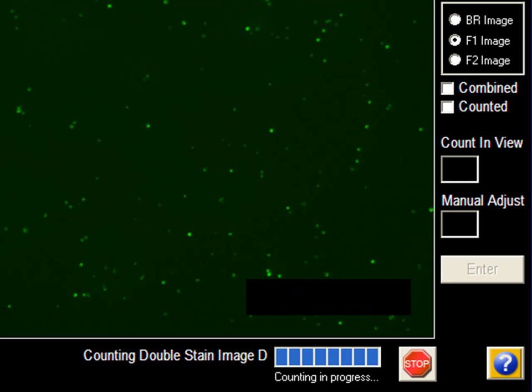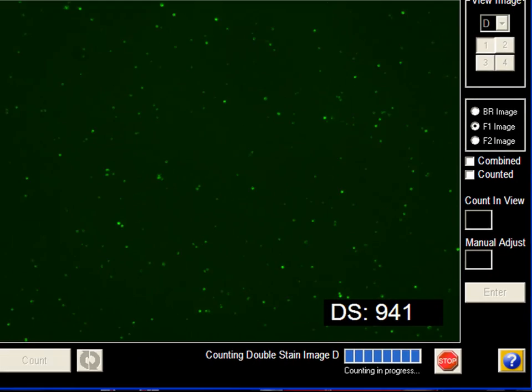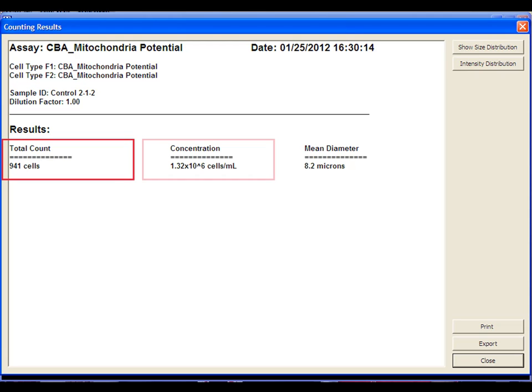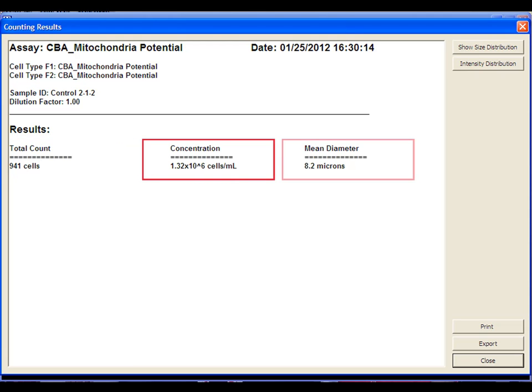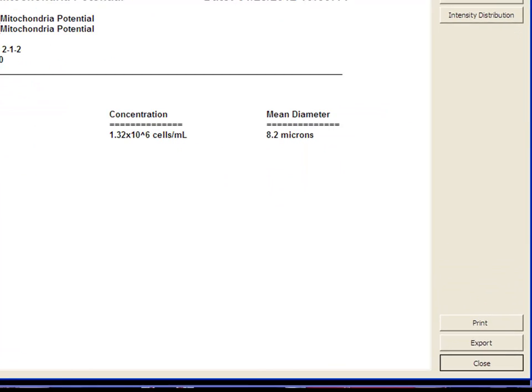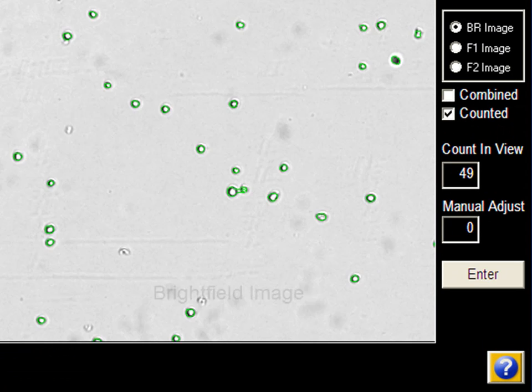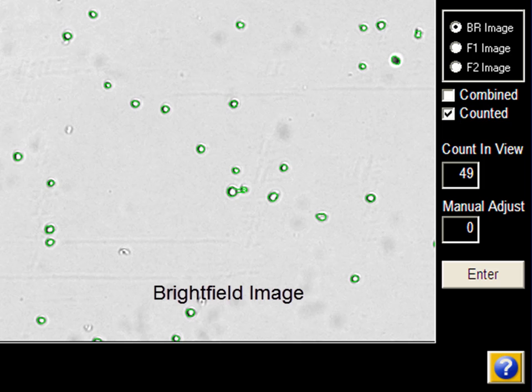When cell imaging and counting is complete, the initial results table displays total cells counted, concentration, and mean diameter. The bright field image can be viewed to verify cell morphology and identify cell clumps.